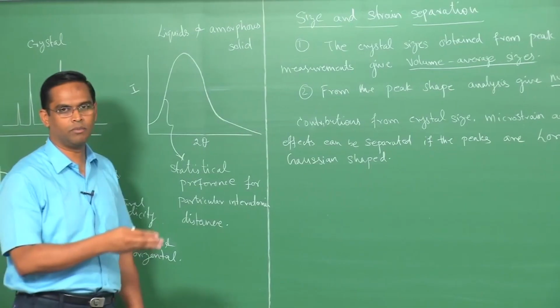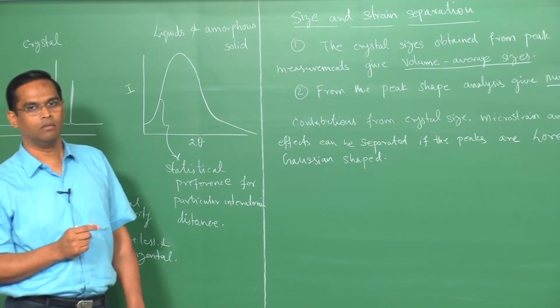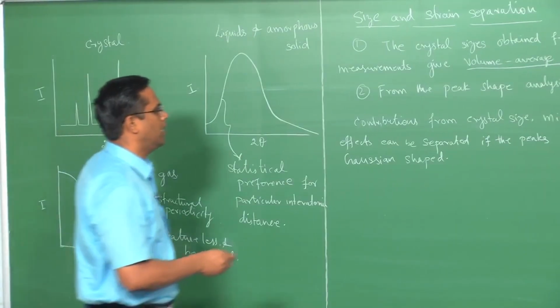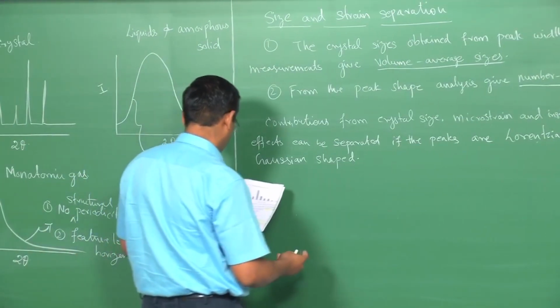Just before, we have seen in the slides how these peaks are modeled, and if your peak is close to these models, then separating these effects is straightforward. We will see how.